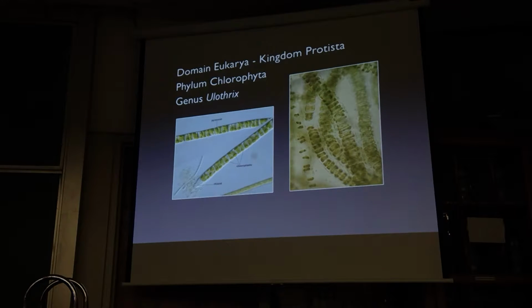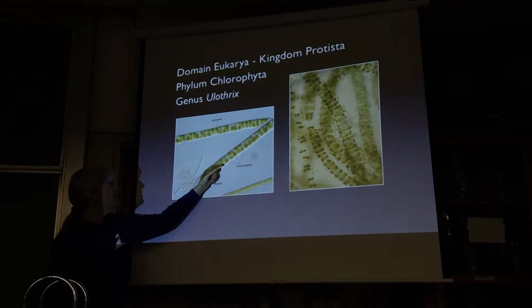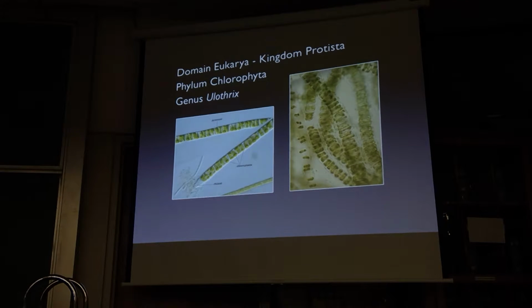You've got a good imagination. Imagine the ends of it bent over, and now it's turned like this. So as you're looking into these cells, you can see the upper surface of each chloroplast. See these here? And then the U shape is down and around, back up. Really, it's like that. Sometimes there's only 1 chloroplast per cell, sometimes there are 2, but they're U-shaped chloroplasts.